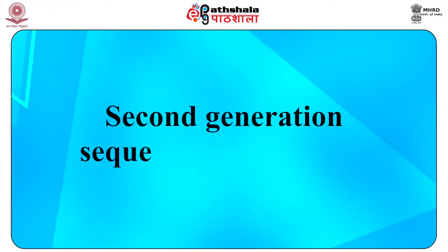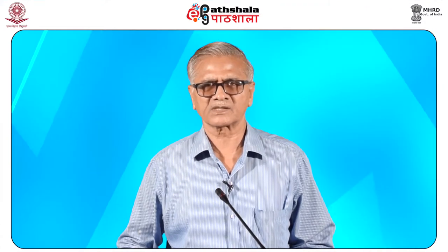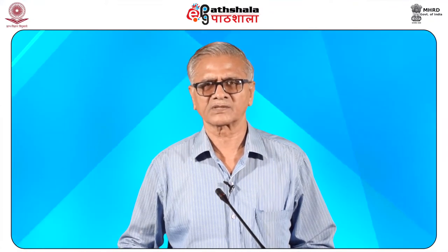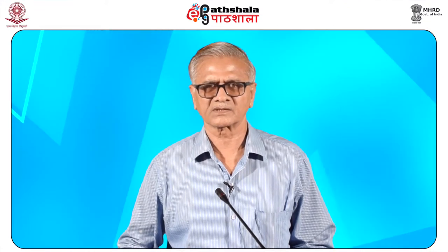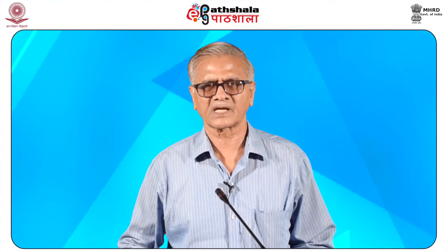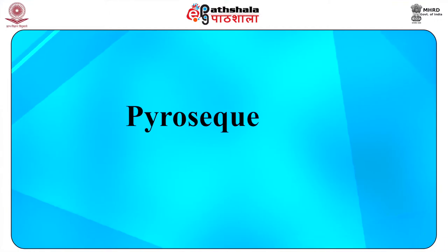Now we come to second generation sequencing techniques. The key feature of second generation sequencing methodologies is parallelization of a high number of sequencing reactions, achieved by miniaturization of sequencing reactions, highly improved detection systems, and reduction in cost and sequencing time to hours. Some of the second generation sequencing techniques are pyrosequencing.